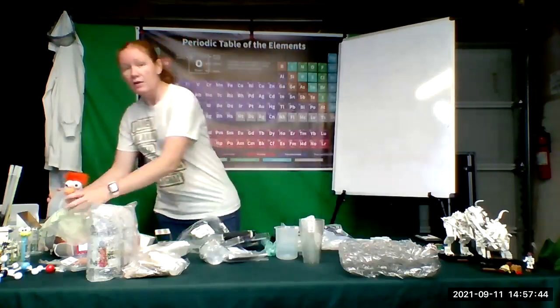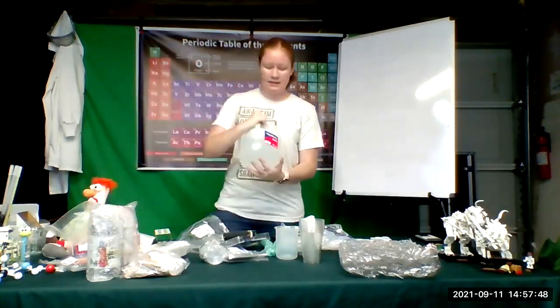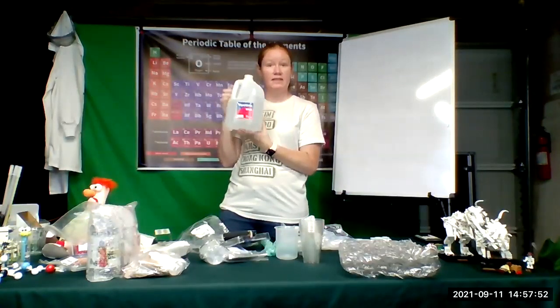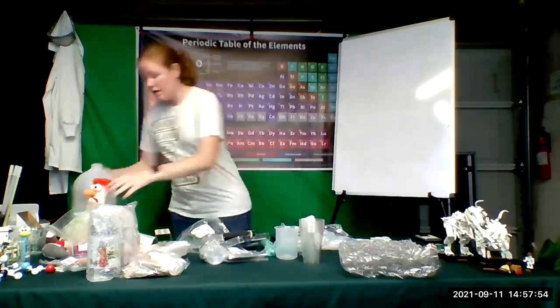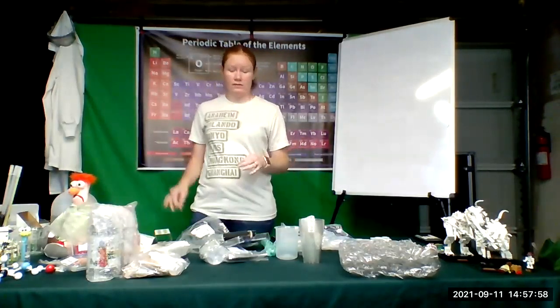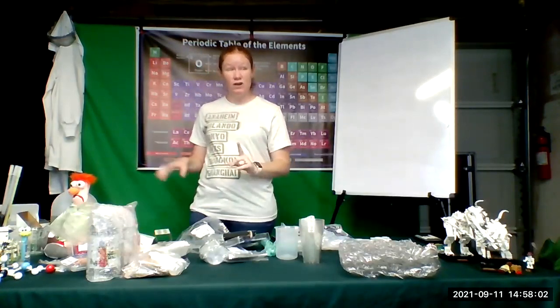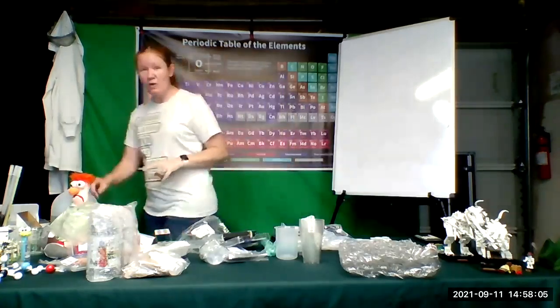Now, when you clean them, you will need distilled water. Okay, so this bottle of water is okay. This is just distilled water. A lot of the experiments, if you need water, you want distilled water. Every once in a while, we can use tap water, but for the most part, you want to use distilled water. Right? So when you're buying your water, be really careful.